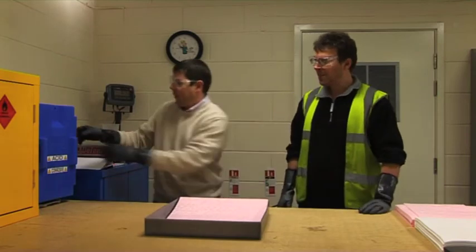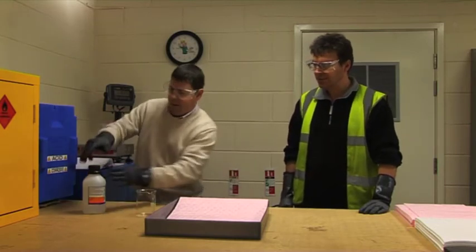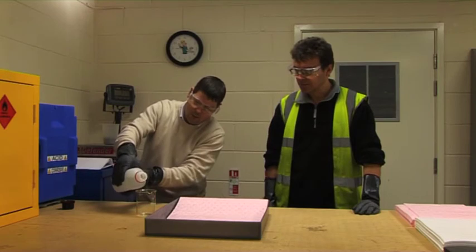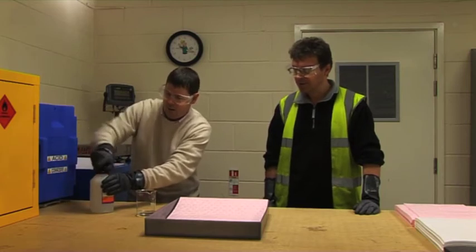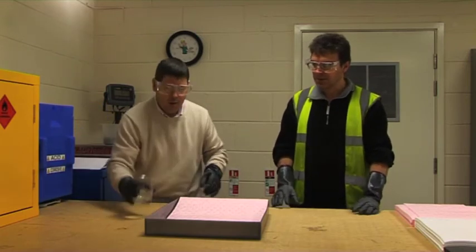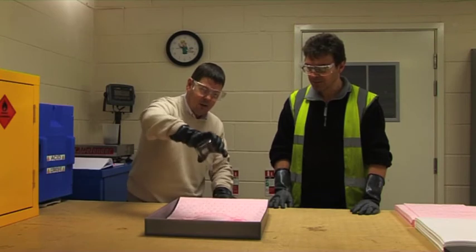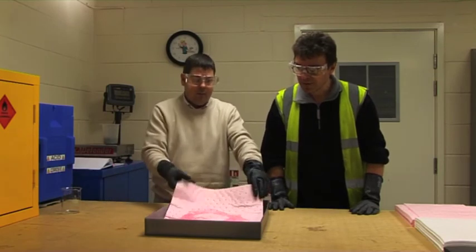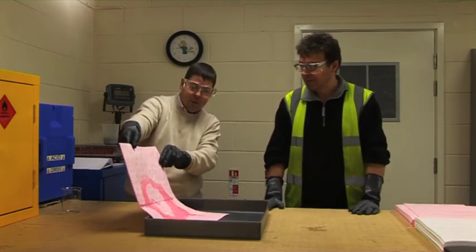So we'll take some Pig Hazmat and we're going to pour some into a beaker. Just give that a couple of seconds — and there you go, that worked really well, didn't it? Battery acid is no problem, Pete.